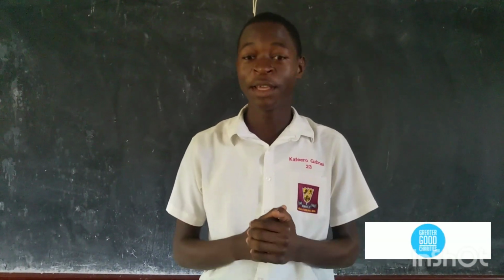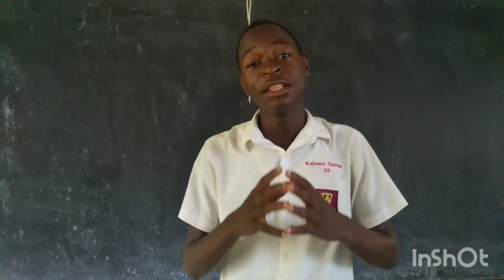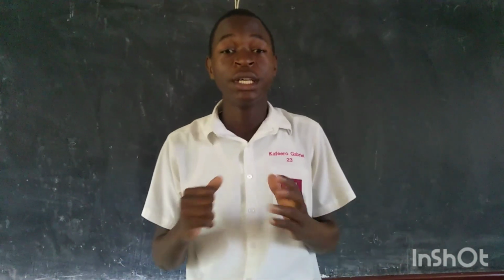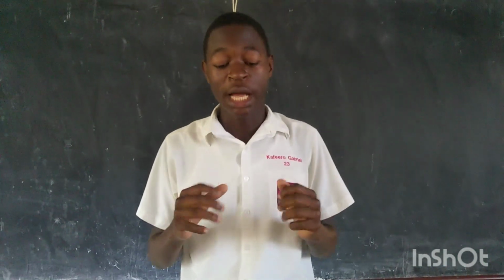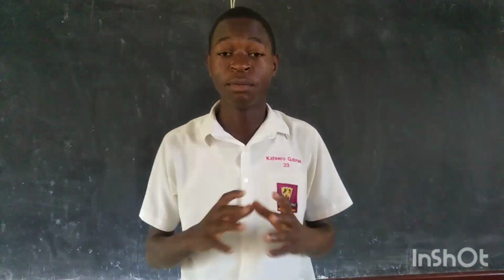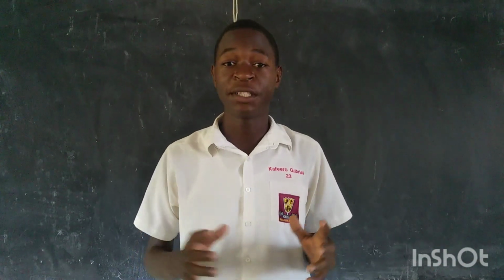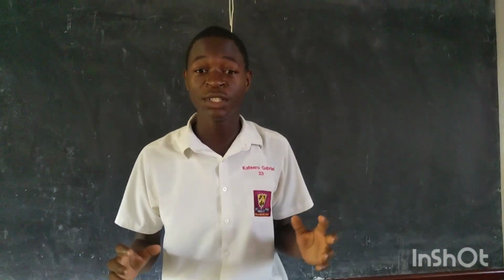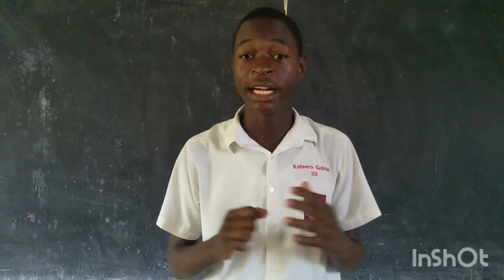So today I'm here to share with you a simple experiment. This experiment is about explaining how water can be separated from sand, or how sand can be separated from water. This process of separating sand from water is scientifically called decantation.